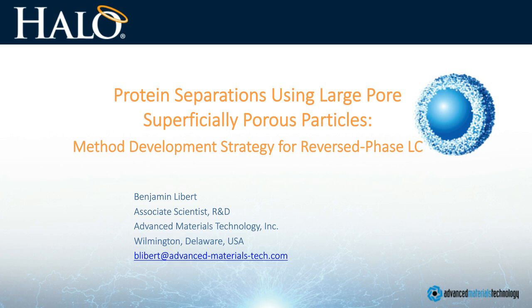Thank you, Ann. Thank you, everybody, for being here today. We're going to be talking about protein separations and using the large pore, superficially porous particle. First, I'm going to start talking about some particle characteristics, some history behind the particles that we make here at Advanced Materials. And then I'm going to go into some options for improving protein separations by reverse phase. So we'll talk about stationary phase options and some mobile phase ideas.